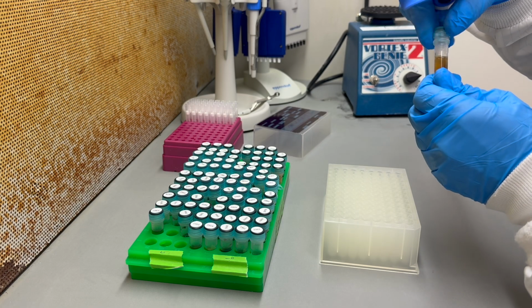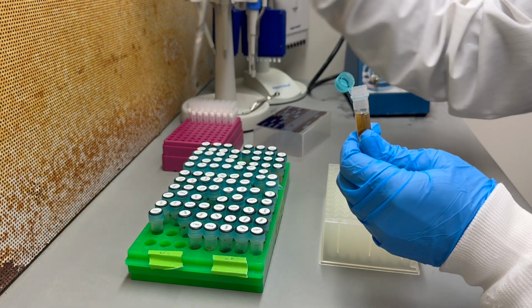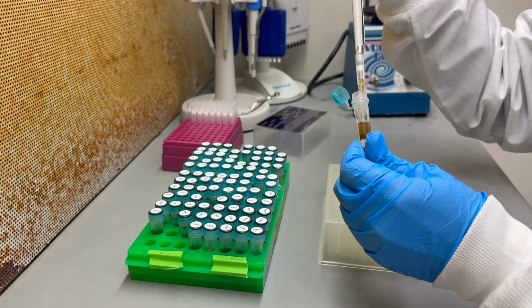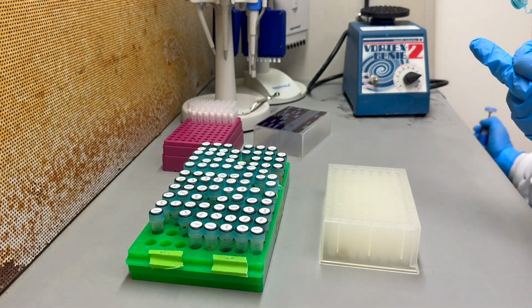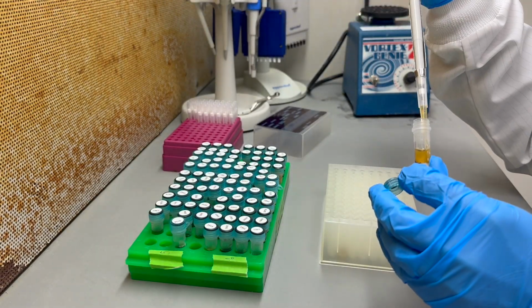Once I've got all my samples laid out, including the field blanks, and I know where my PCR and extraction negatives are going to be, the next step is to centrifuge everything and then transfer just the supernatant, which is the clear liquid from the top of the sample, into a plate where the actual DNA extraction is going to happen.